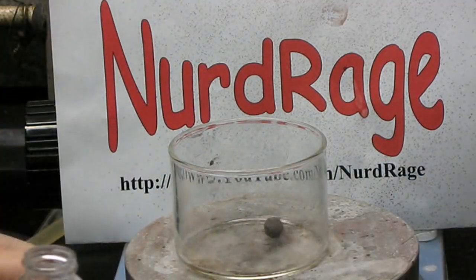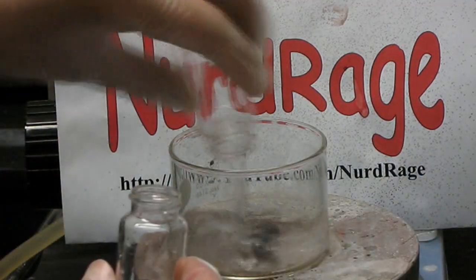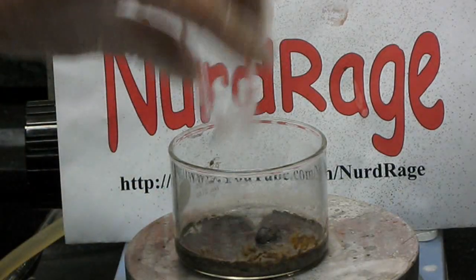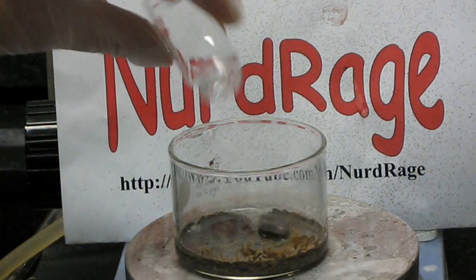The spinning black bead you see here is a magnet that helps us stir our chemicals. As you mix them together, they'll instantly form a dense precipitate of silver oxide.